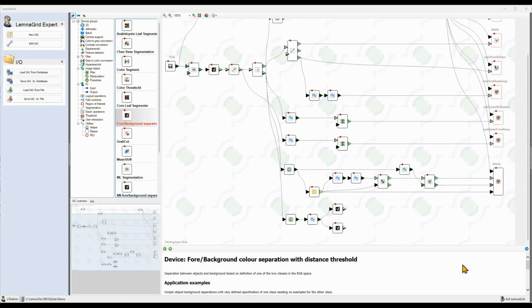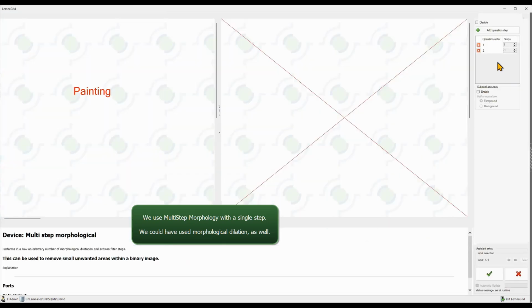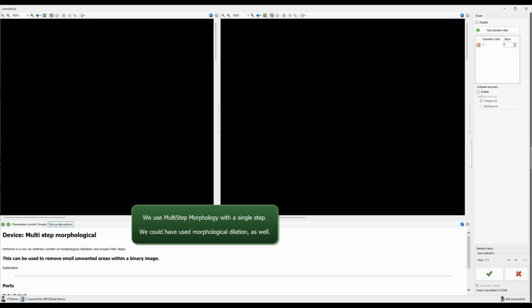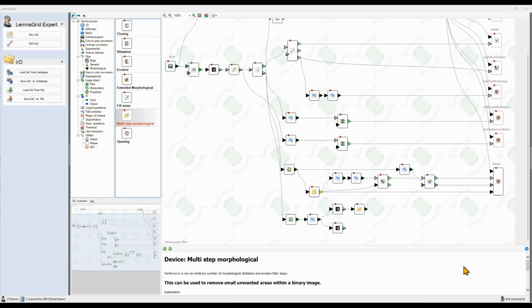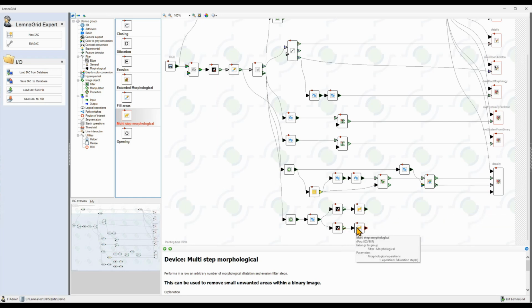Next, we will expand them by, for instance, 8 pixels. Using this value, all joints which are closer than 16 pixels to each other will be considered a cross. You may change this value to match the requirements of your application. This is the aforementioned threshold.